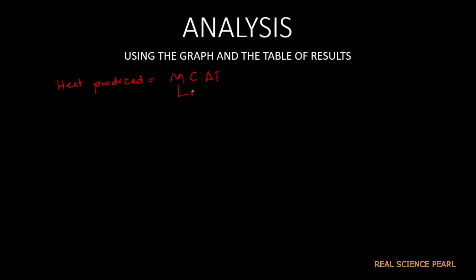This M is mass of the solution. Now this mass of solution is the volume of acid plus volume of the base. Remember, I'd fixed my BA2, which was 20 already. It was my controlled variable. Then I read the volume of BA1, which has reacted to give us the very highest temperature on the graph, and it was 15.